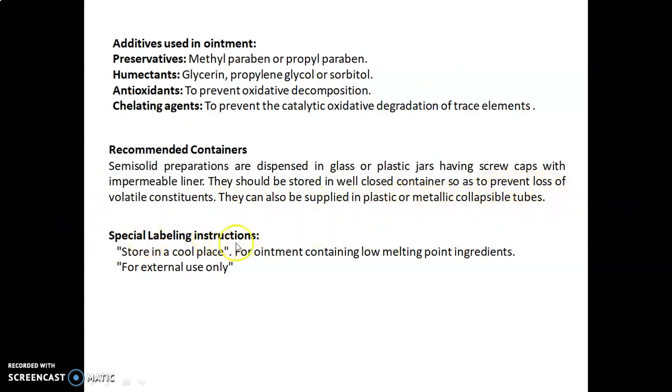Then special labeling instructions: first, store in a cool place for ointment containing low melting point ingredients, and second, for external use only. In the next session we will see in detail about the experiments.